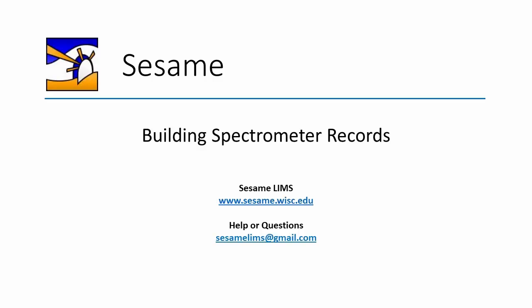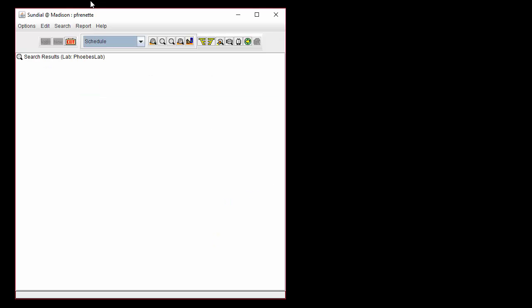Hello and welcome to this video tutorial about using the Spectrometer Lab Resource in Sesame. For this tutorial we will use the sundial module.